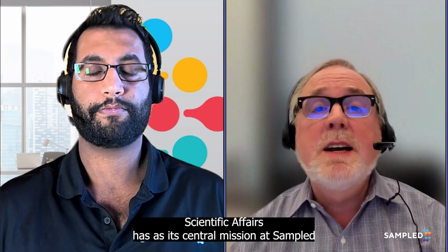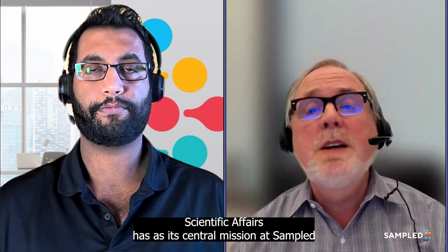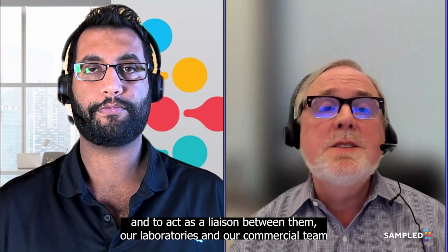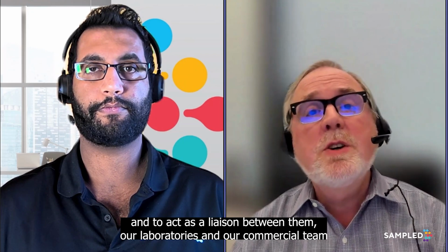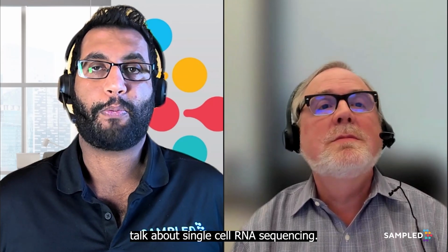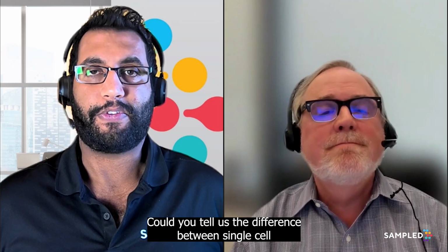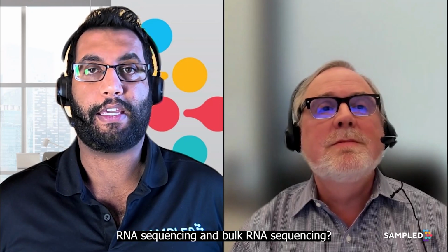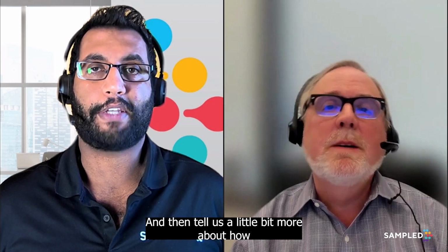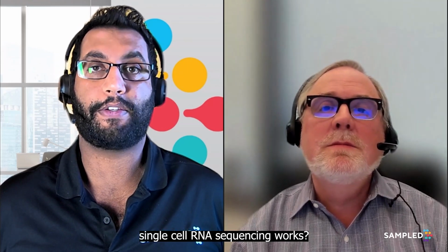Scientific Affairs has as its central mission at Sampled to provide technical resources for our clients and to act as a liaison between them, our laboratories, and our commercial team to ensure that our clients get customized solutions to enable success in their research. And we're here to talk about single cell RNA sequencing. Could you tell us the difference between single cell RNA sequencing and bulk RNA sequencing? And then tell us a little bit more about how single cell RNA sequencing works.